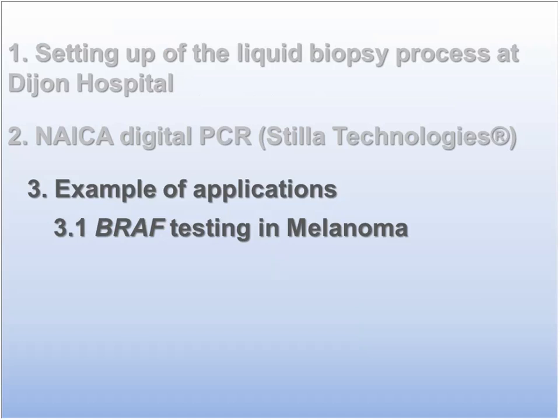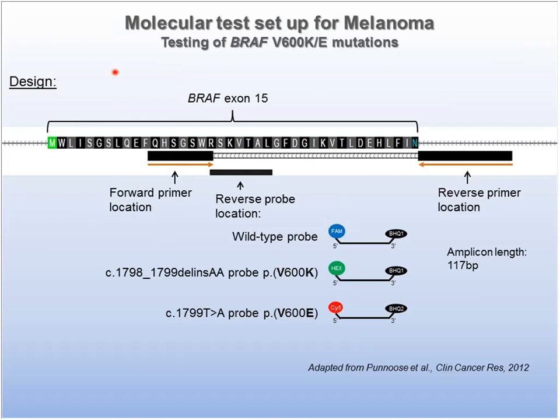So now in the third part of my presentation, I will show you some examples of application. And the first is for the BRAF testing in melanoma. In this context, we use a design targeting the most common BRAF mutation in melanoma. So you see here this design.